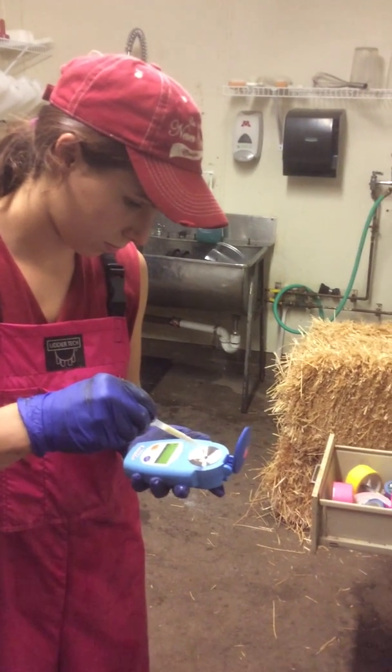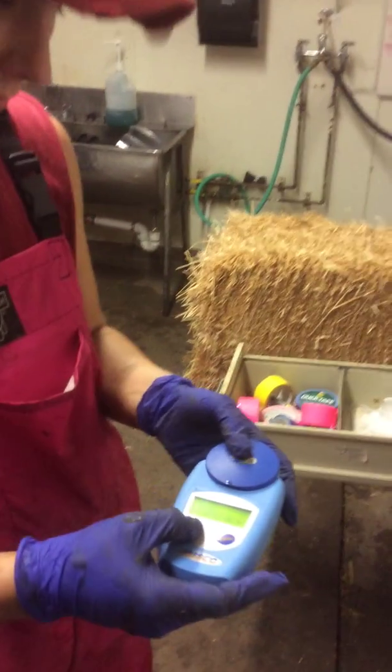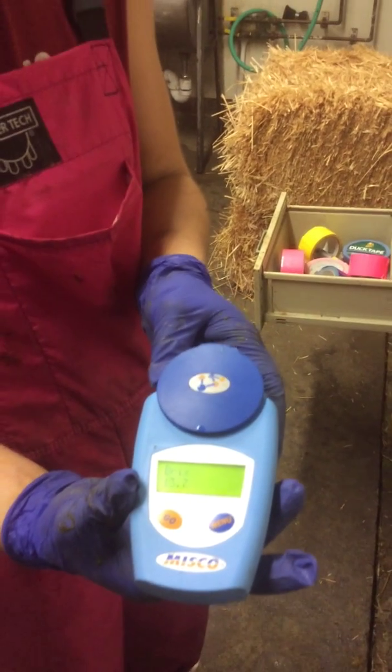Grab a new pipette dropper and fill the metal plate. The dropper can then be deposited in the trash. Press the go button on the left. This time the reading says 13.7.